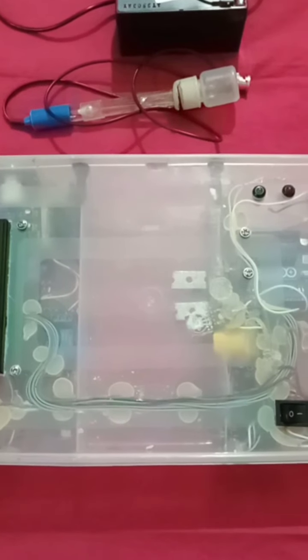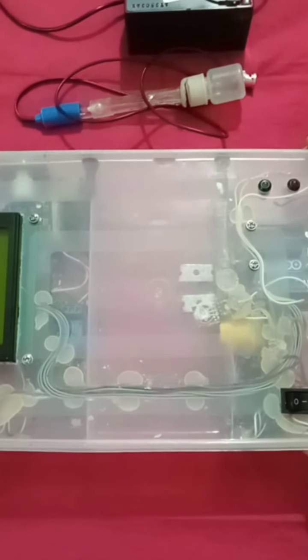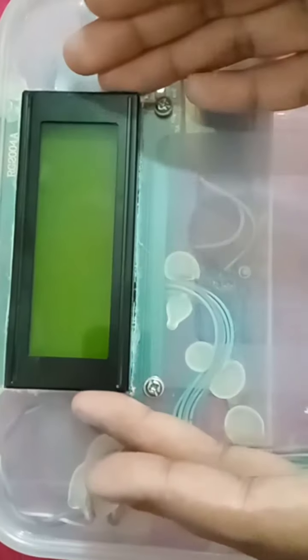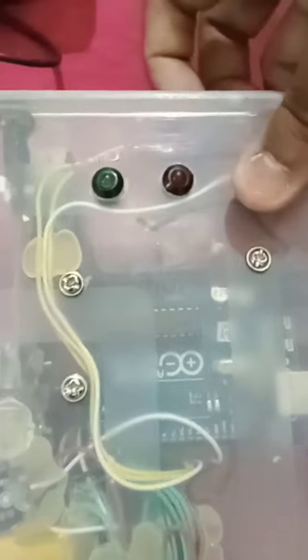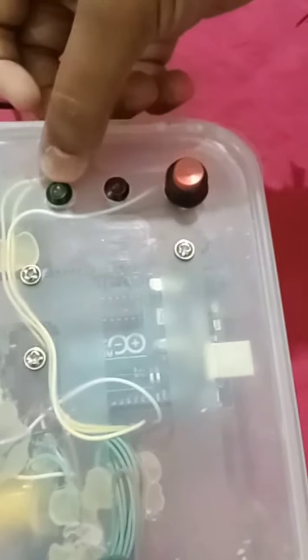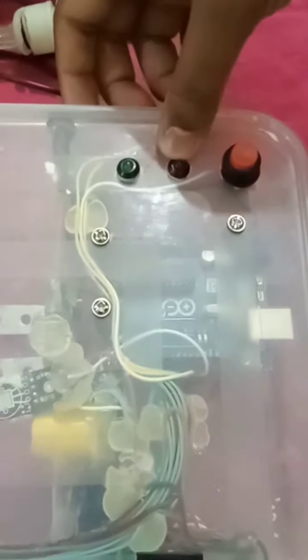Hi guys, this is the proposed system for measurement of adulterants and nutrients in milk. Coming to the LCD display present here, it is a 20x4 LCD display which will display the measured output. Here we have a switch which will be triggered by the 12 volt power supply, and this is the push button which will initiate the operation. We have two LEDs here. The first one is the green LED and the second is the red LED. Green LED indicates pure milk and red LED will indicate adulterated milk.